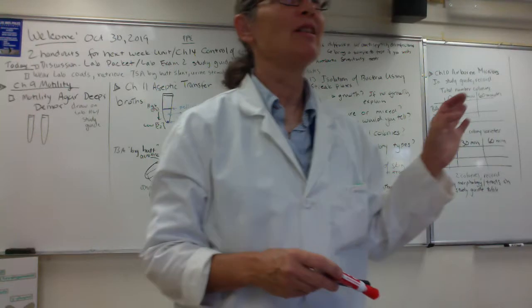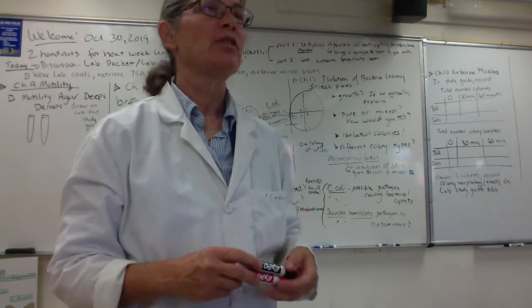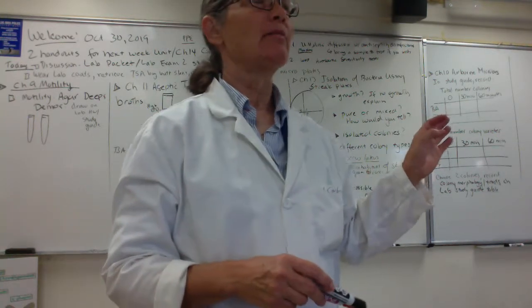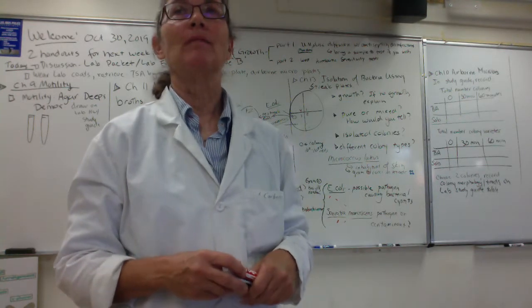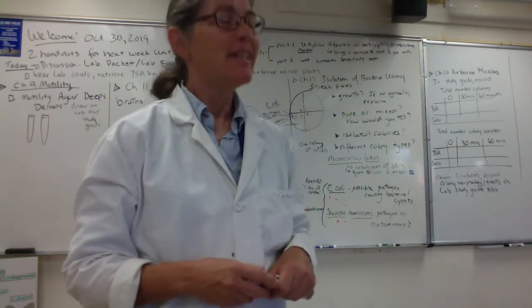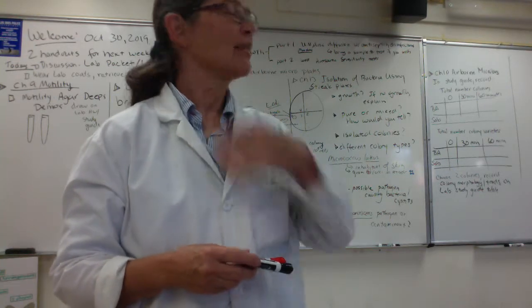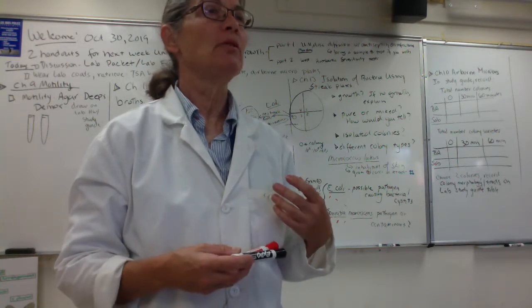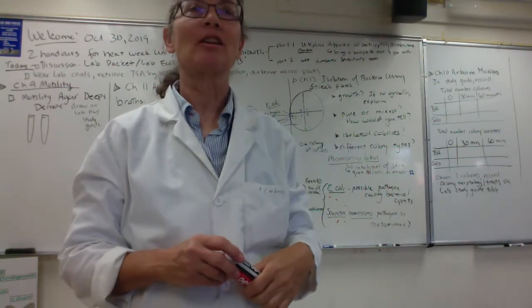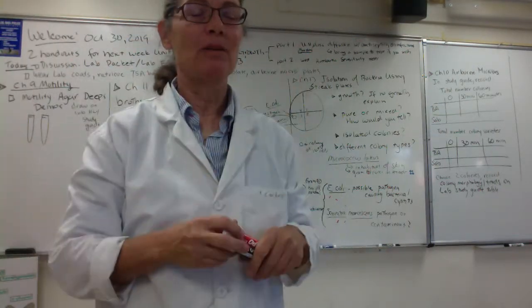Serratia. It's so funny, you guys. Serratia was originally described as causing diseases, infections of plants. And this is so bizarre, you guys. Back in the days when the U.S. was more concerned about biological attacks, they did this study, you guys. This is horrible. I'm smiling. I shouldn't be smiling. But what they did is they thought Serratia marcescens wasn't a pathogen of humans. They had an experiment where they would spray it from airplanes over San Francisco to see where it would float to, right? And then they would sample for it. It's great because it's got those nice big red colonies.